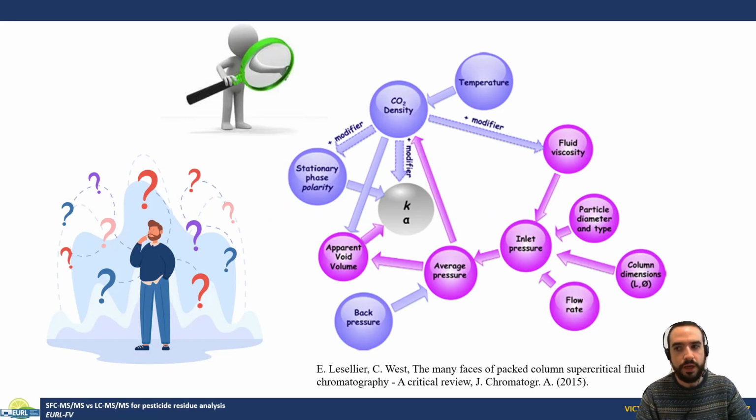This is a scheme of the elements that influence the retention time in SFC, mainly because these factors modify the density of the mobile phase directly or indirectly.